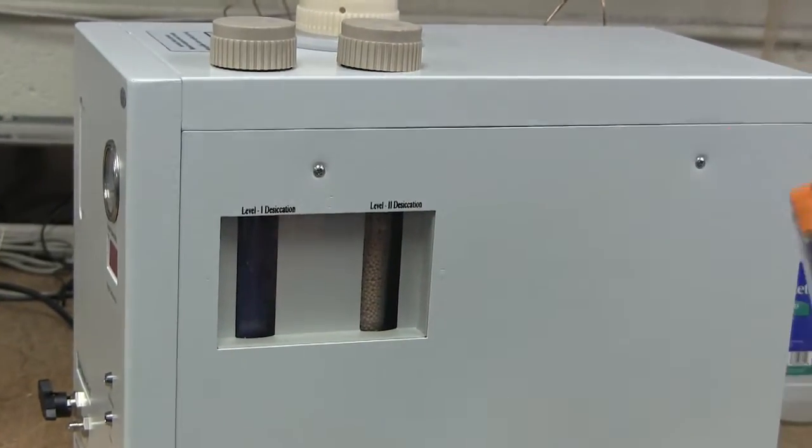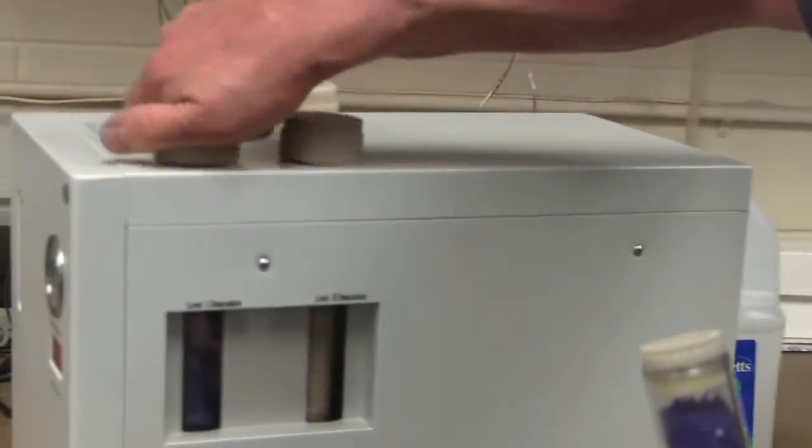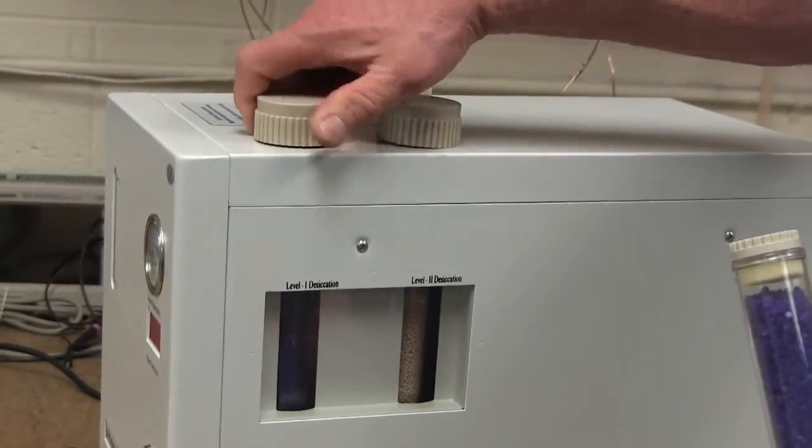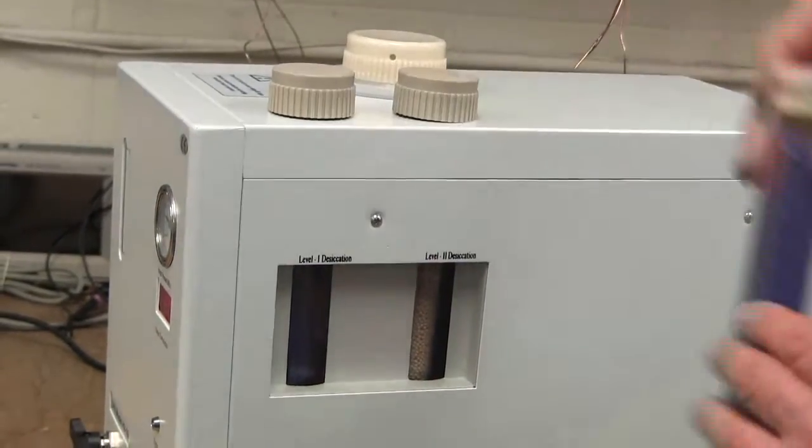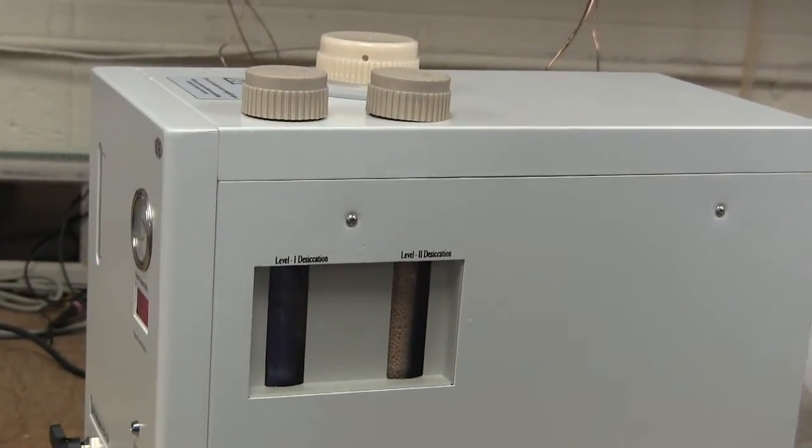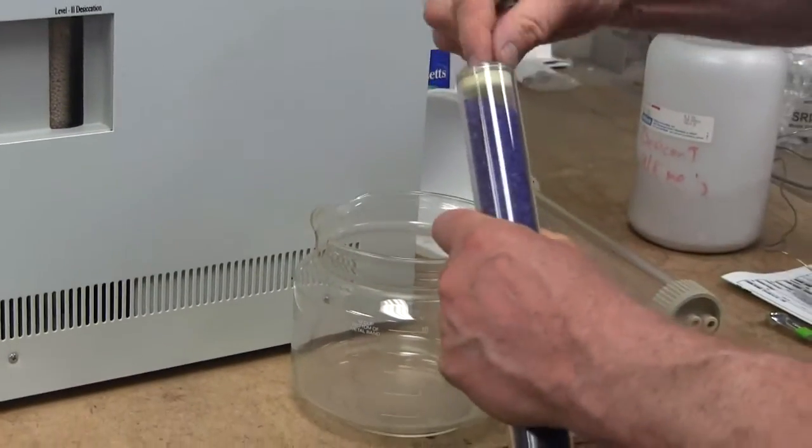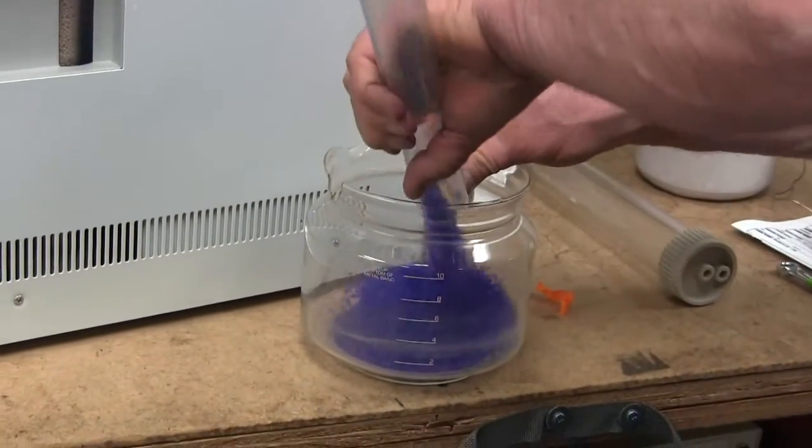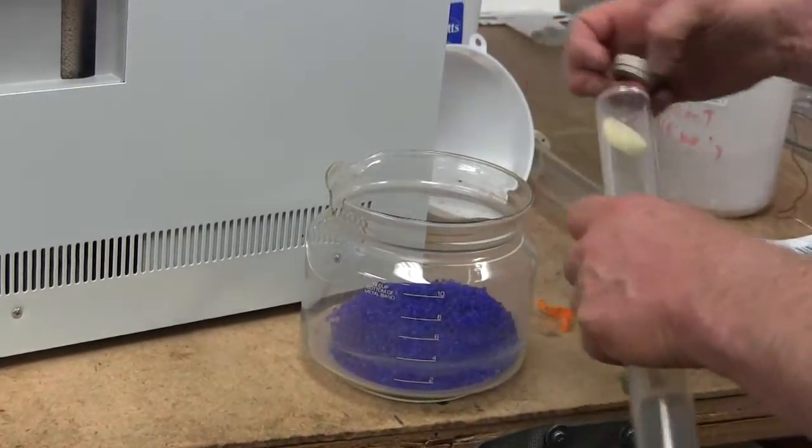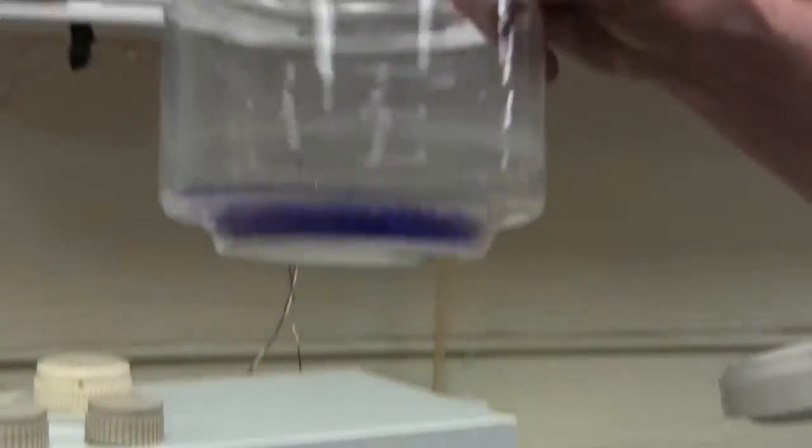So the way you regenerate the silica gel is you remove the silica gel from the hydrogen generator by unscrewing this cap here, and then this tube pulls right out. So find a coffee cup or some kind of glass container, and unscrew the top of the silica gel, and pour the silica gel into the glass container, and then take it over to the microwave and microwave that for five minutes.